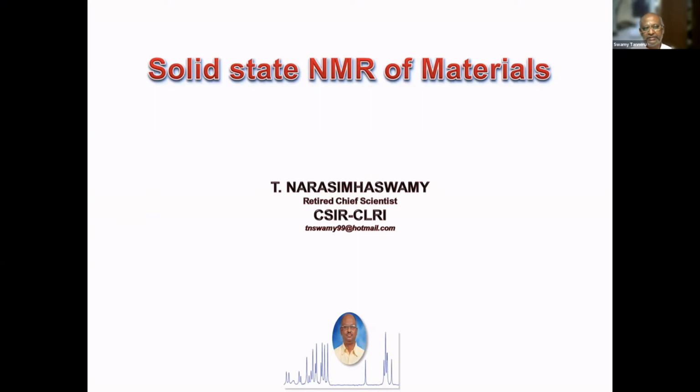So today I will be presenting about solid-state NMR of materials. Nowadays, material means many areas will come into picture. I have given importance to the organic materials. In a few cases, other clay which are NMR active is also shown. My main area is thermotropic liquid crystals, as a few minutes back I was introducing to you.